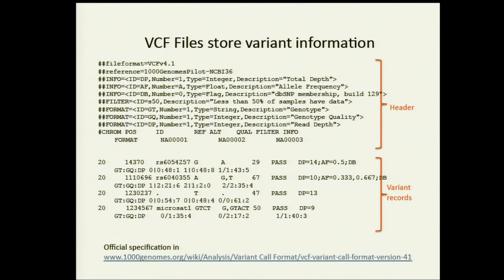And finally, the VCF format. This is the format that represents the mutations inside your data. Again, the header here is not quite as important as the BAM header, so we're not going to go over it. We're just going to go over the last header line. I should also say that because of formatting issues, from this line onward, each 2 lines is really one long line that I couldn't fit in. It was just going to wrap over. So this is all one line here.